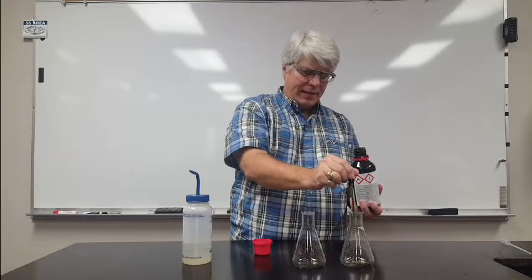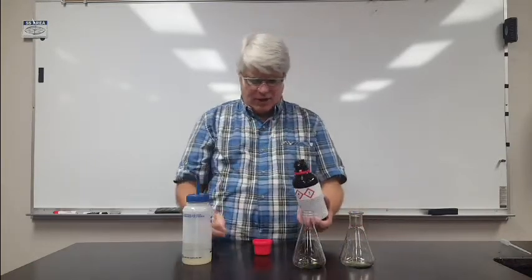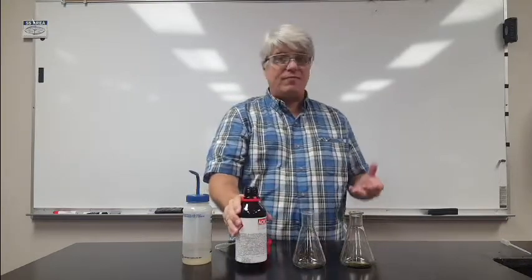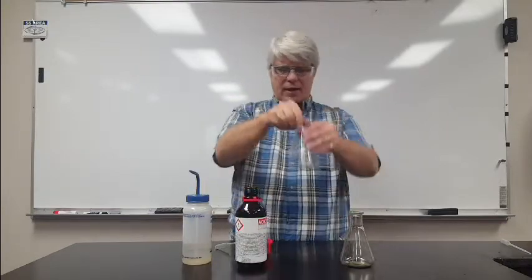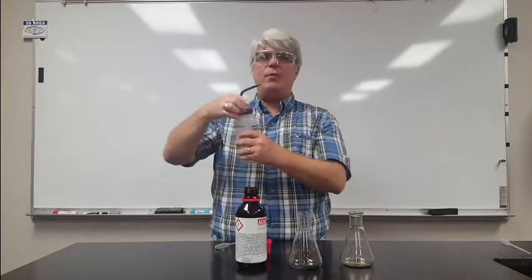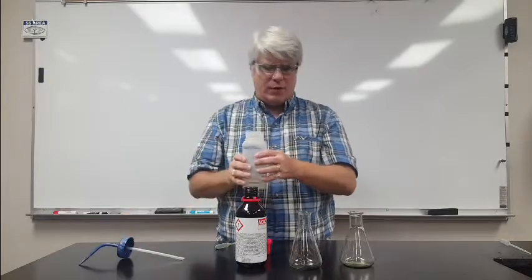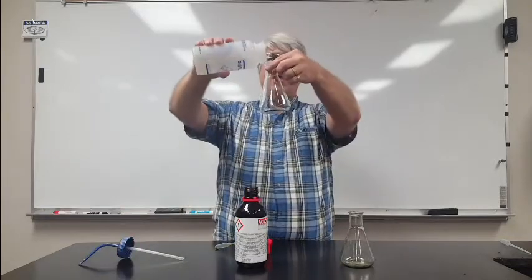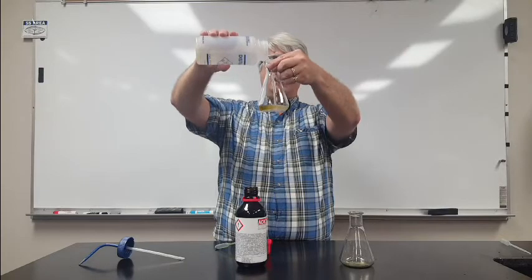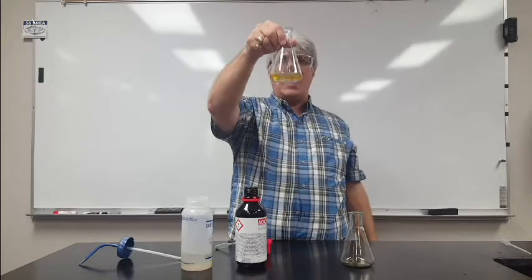I'm going to put a little bit into each flask. This pH indicator turns different colors depending on the levels of acids and base it's exposed to. I'm going to take this flask and fill it with distilled water. Distilled water is about as pure water as I can make it in the lab. I'm going to add the distilled water to the universal indicator — notice it's yellow.